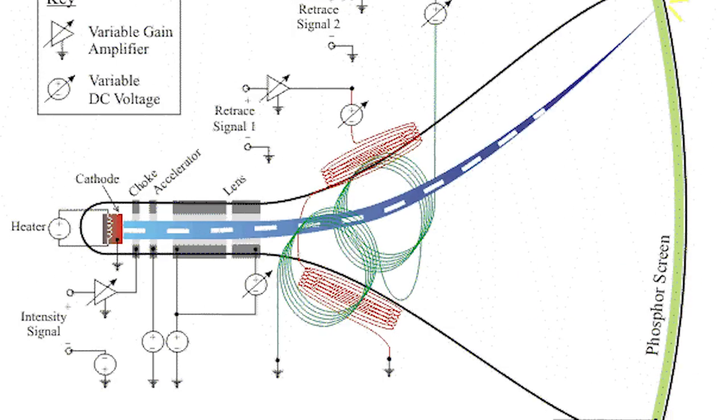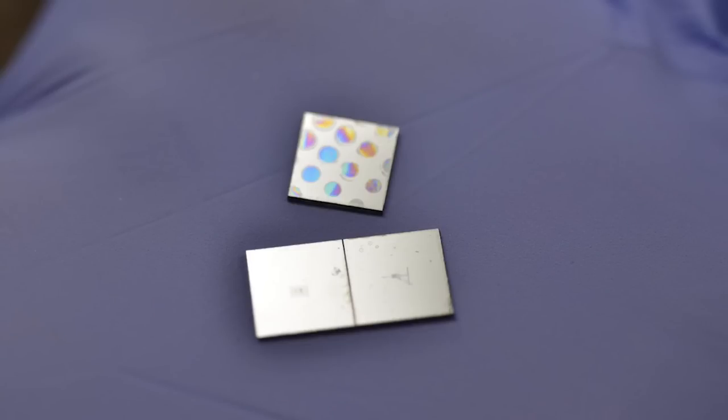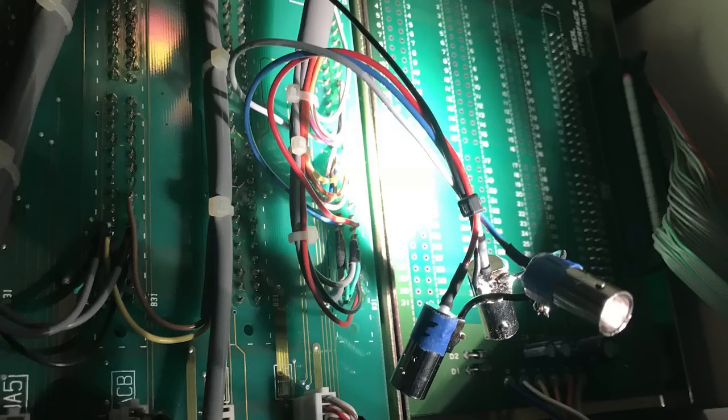We use the scanned coils within the microscope to control the beam and draw with it in X and Y, and create the sample that we'd like to make. So the first thing we need to actually do this is control of the beam in X and Y. The back of my microscope has connections on it for an external scan controller, and you can give it plus or minus 10 volts on the X and Y connections, and it will deflect the beam to its maximum deflection.